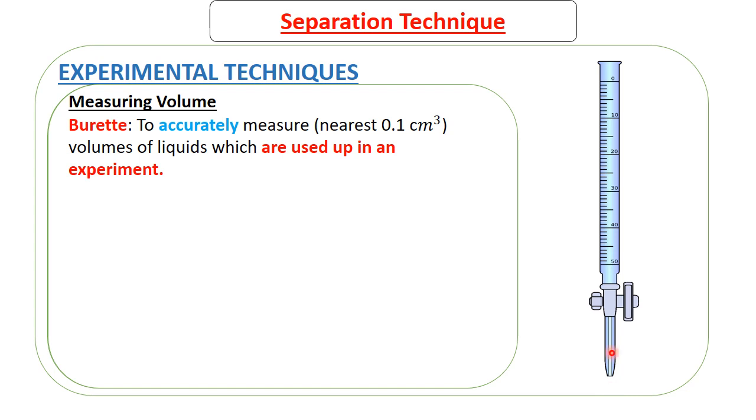Then as you do that, as the other reactant is flowing down, you can lock it again so that you see the results. If you don't get your results, you open again so that more of it goes down, and again you lock it, you wait. When you get the desired results, then you can go and look at how much has been used.